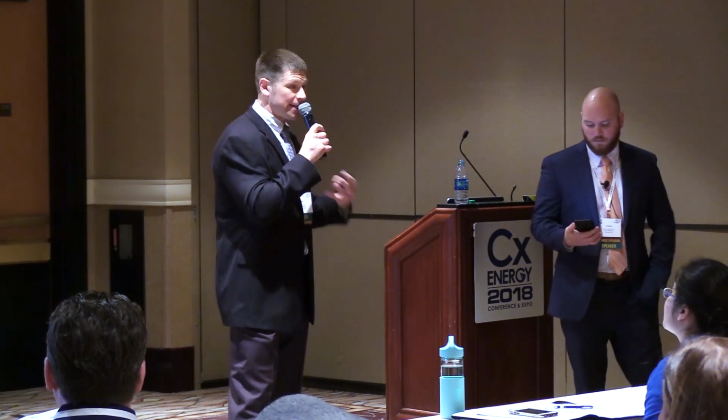And so here again, design considerations. What's happening in these labs when they're turning over, they get a new grant, a new research project, well, they need a new facility. And in these old laboratories, a lot of times we see labs that are not intended for a certain use, they're retrofitted to accommodate that use. And sometimes they're trying to make a BSL out of something that was not intended to be a BSL lab, and they just kind of barely squeak by and meet the criteria, but it's not really working well. And sometimes we'll come into a lab that was a BSL and it's been switched back to something else.